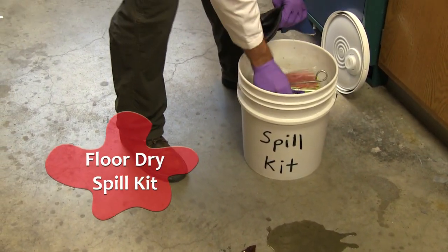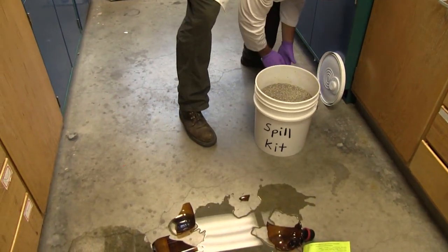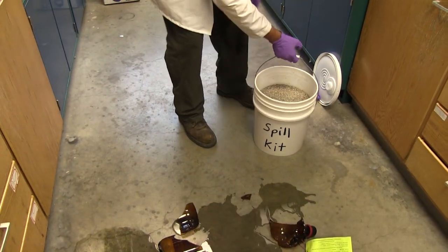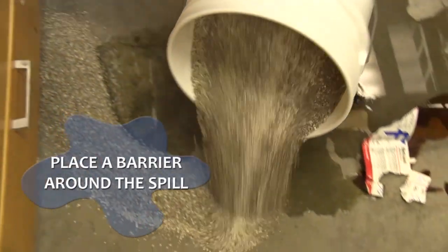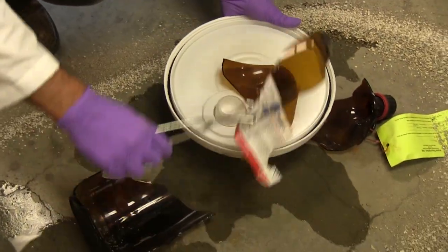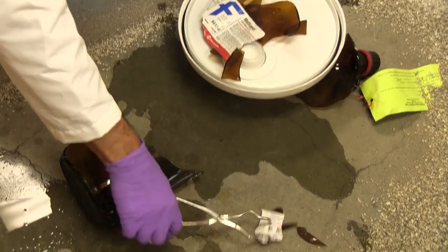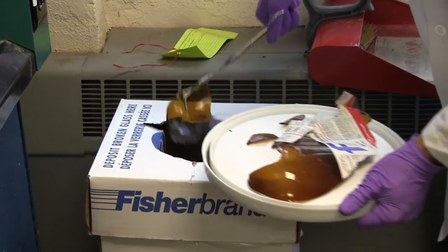First we'll show you how to clean up a spill using a floor dry spill kit. Place an absorbent barrier around the spilled material. Use tongs to remove any broken glass from the liquid. If dry, remove the green waste tag from the broken bottle to keep for later use.